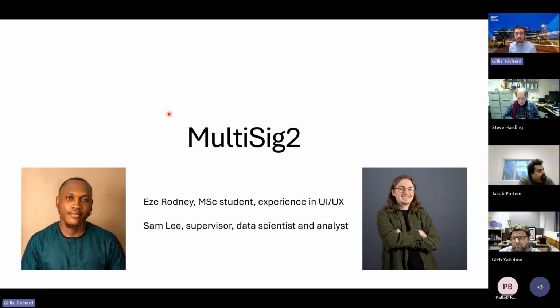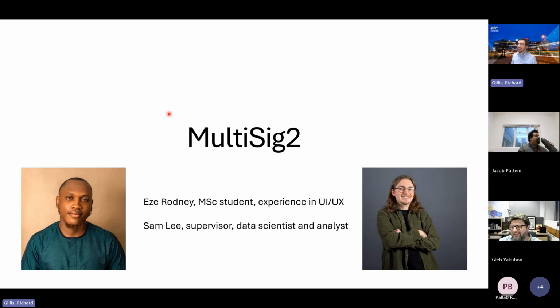And rather annoyingly, he titled it Update of Legacy Software, which I was like, what do you mean legacy software? It's from 2012. Oh yeah, okay, that's 13, 14 years ago. Oh, that's okay, fair enough. Anyway, yeah, okay, it's legacy software.